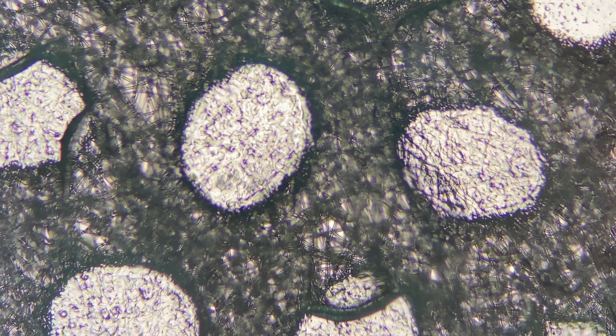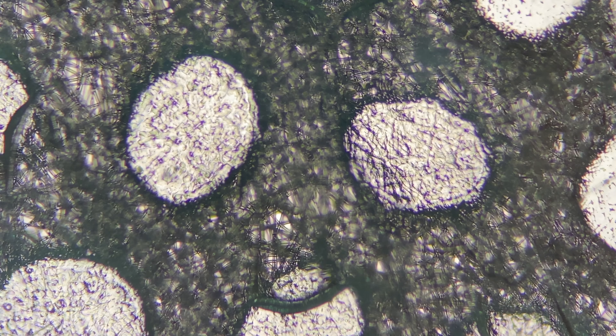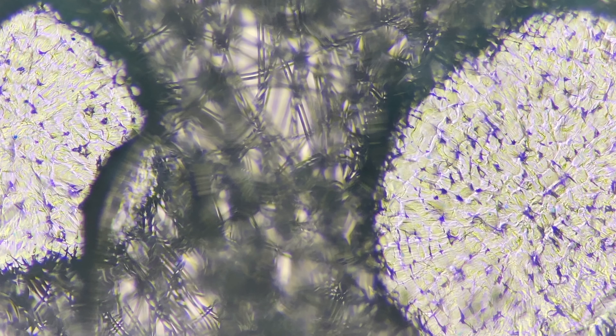We are now seeing through the mask at 40 times the magnification. This is now at 100 times. You can really start to get an idea of how coarse the mask is.